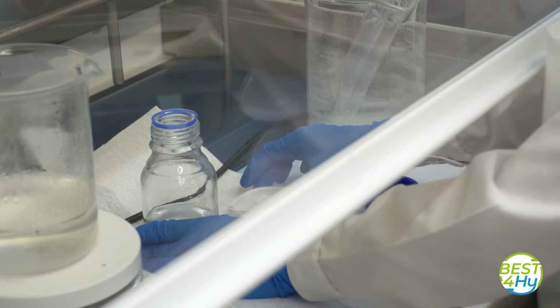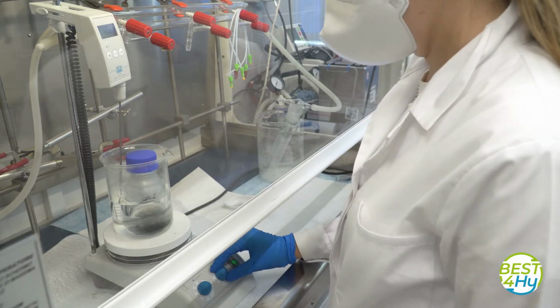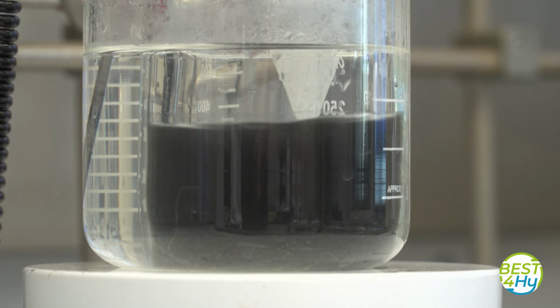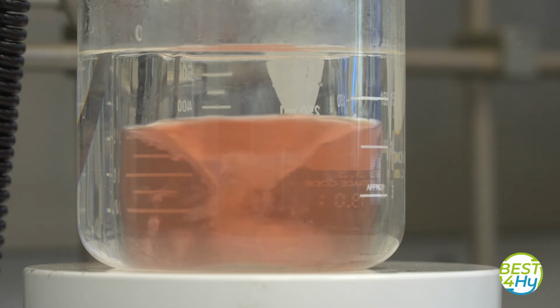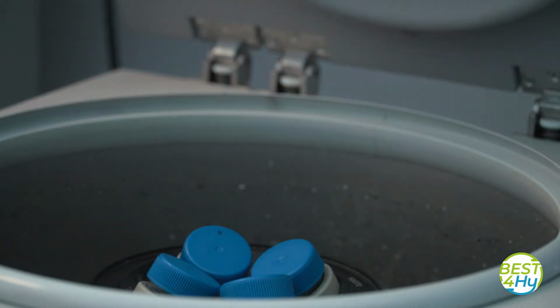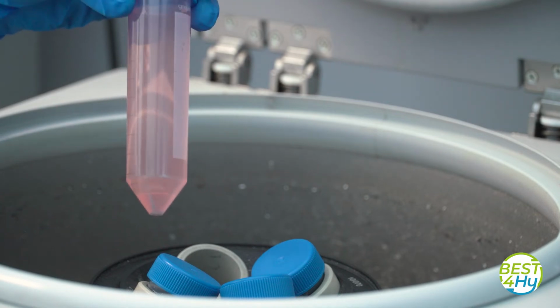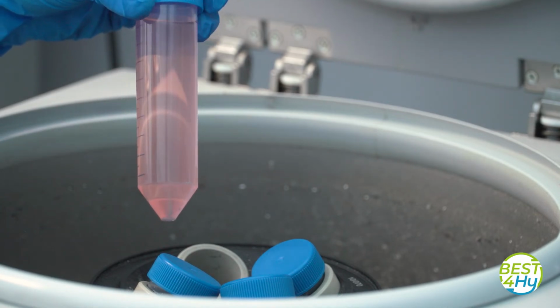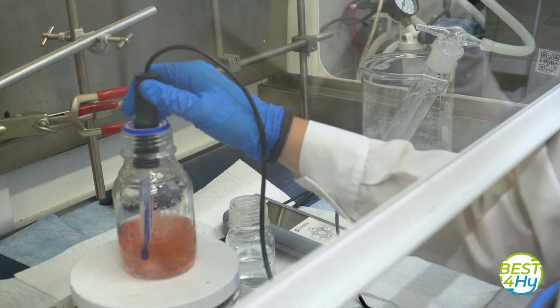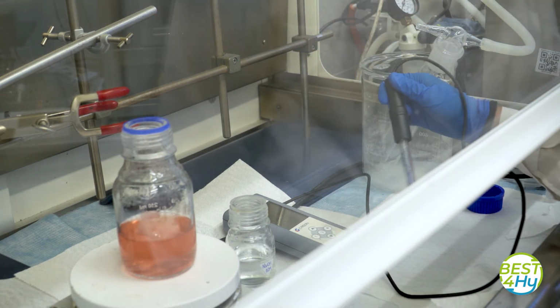For the cathode, a leaching process with nitric acid is performed on the sieved powders to extract lanthanum and cobalt. After 3 hours, a pink dispersion rich in lanthanum and cobalt is obtained. Through centrifugation, the pink cobalt and lanthanum-rich liquid is separated from the residual yttrium-stabilized zirconia. 2 sequential precipitations at different pHs are performed in order to selectively recover lanthanum and cobalt precursors.